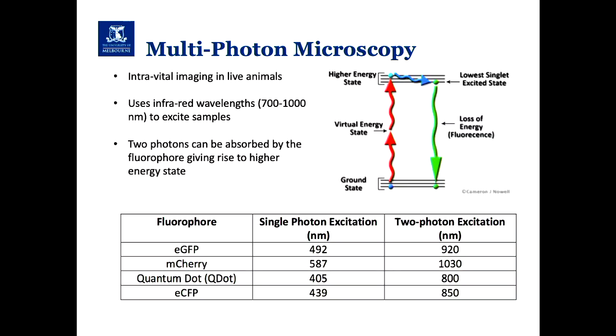In multiphoton microscopy, what we're doing is putting in pulses of laser light, excitation light, and we're relying on 2 photons being absorbed by that molecule at the same time. Now, they have a longer wavelength, which means they have less energy, but if they hit the molecule at the same time, those energies basically add up, and we can still get the same effect. So the fluorophore becomes excited, and then decays back, and then emits light back out in the green wavelengths. Why do we do that?